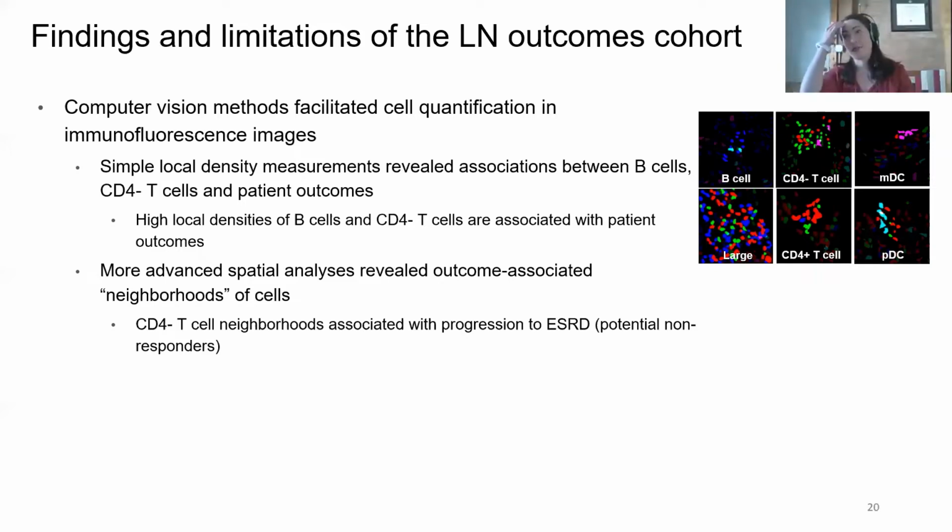Yeah. So that's something I've been kind of interested in. NanoString has their CosMx system, which came out, so you can do proteomic imaging and spatial transcriptomics with that, and so you have that direct comparison that you can do. I don't know if there have been any studies that have done spatial transcriptomics and proteomics on the same samples, but it's definitely something I'm interested in, and that's what the lab that I work with at UChicago is moving forward with, the CosMx system from NanoString.